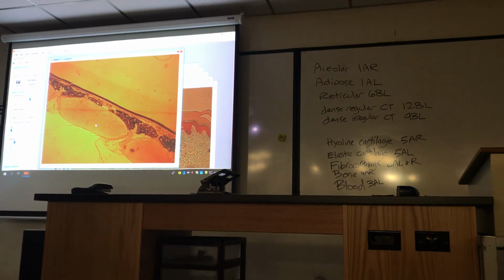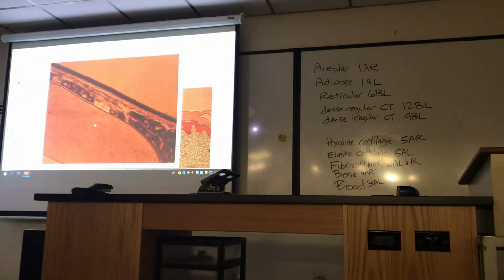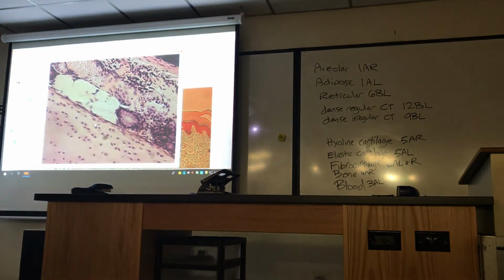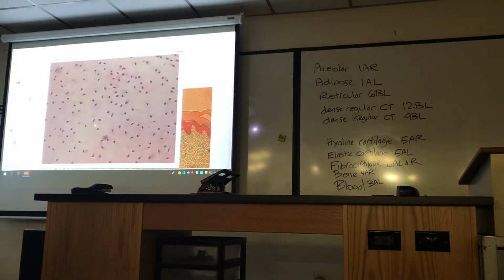That's what you're looking for. So I'll put that into a higher magnification. This is low, here's medium. And then here's high. Good. Take a picture of that.